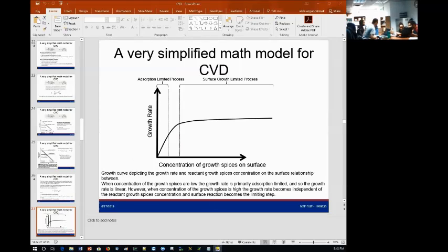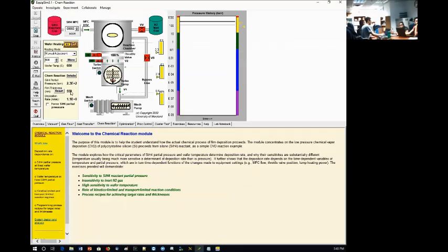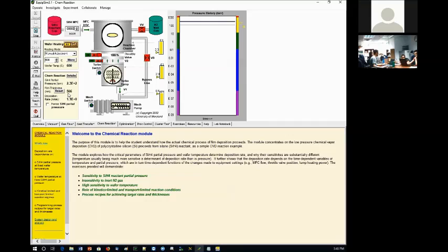All right, now we can close this software. Let's see. We have in all that time deposited 560 nanometer. But our flow of the silane is enormous. That's very high. As I was saying, turn off the heater, turn off the mass flow controller, of course.